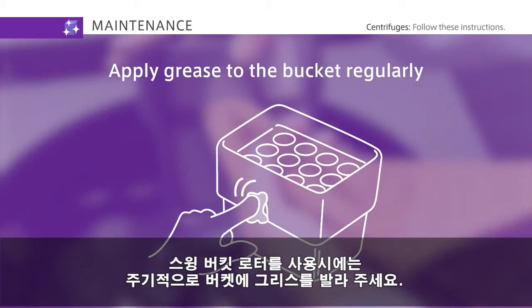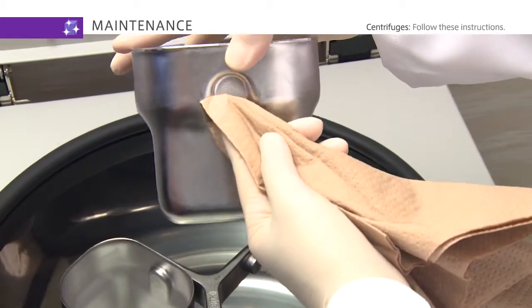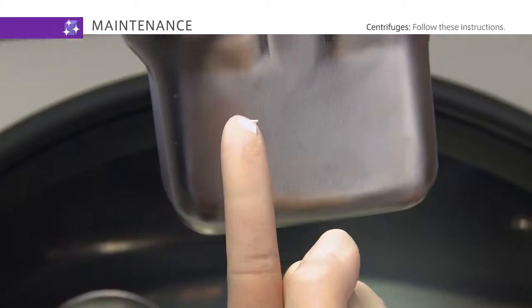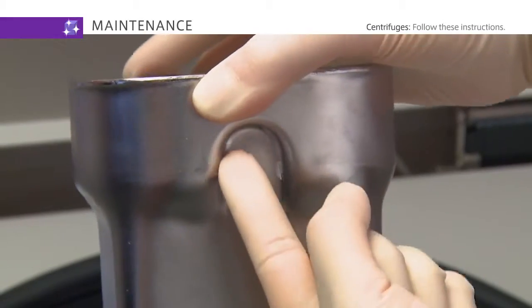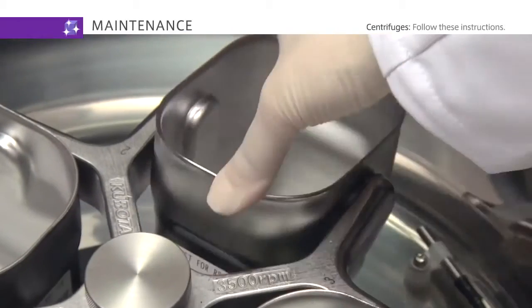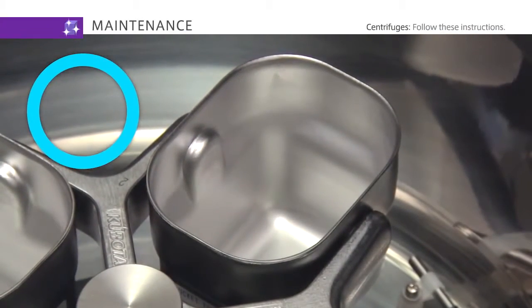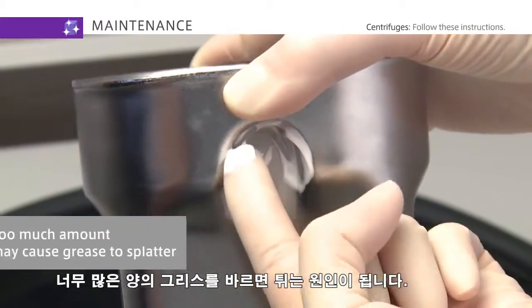When using a swinging bucket rotor, apply grease to the bucket regularly.